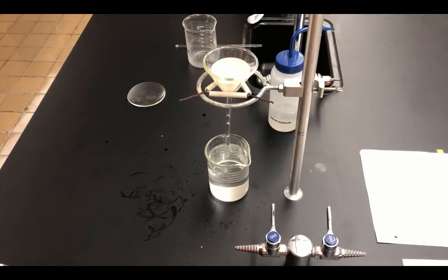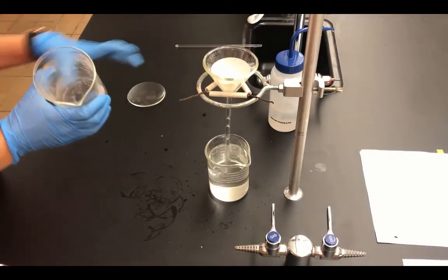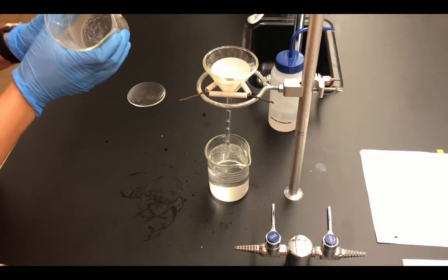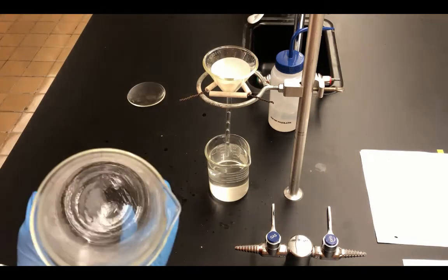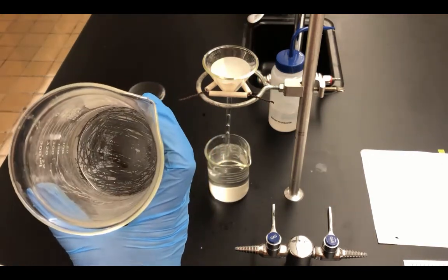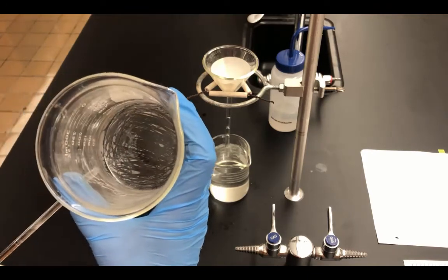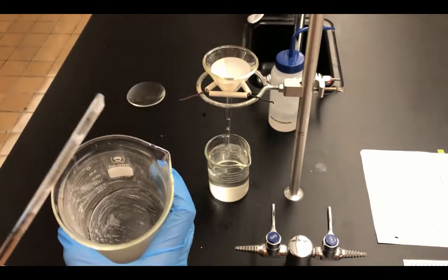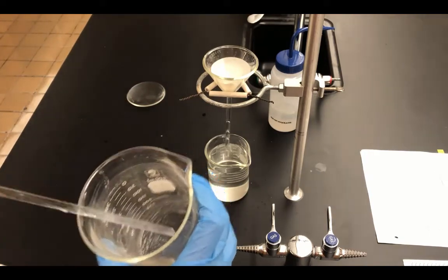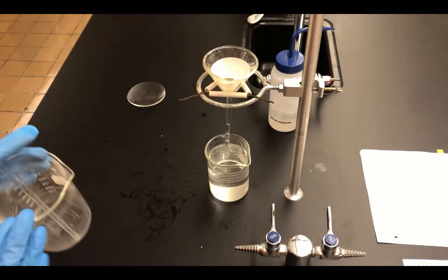After you have poured all of the precipitated solution through the filter, you want to, like I said, make some final observations of the container that the precipitated solution was in. So if you notice, there still is some solid on the bottom that we were not able to get out. Most of it came off the stirring rod, but there are some small solid particles on there as well. So you want to make sure that you add that to your observations.